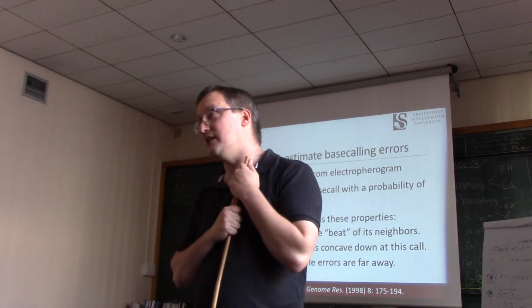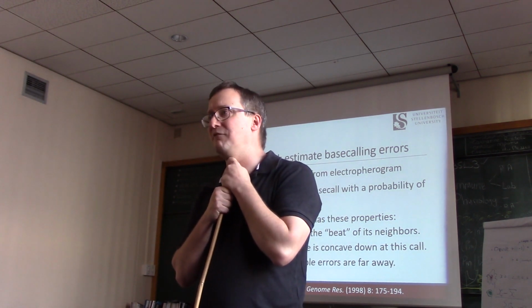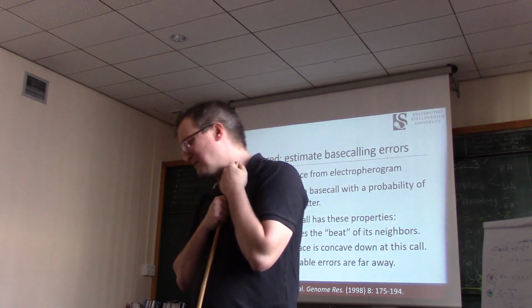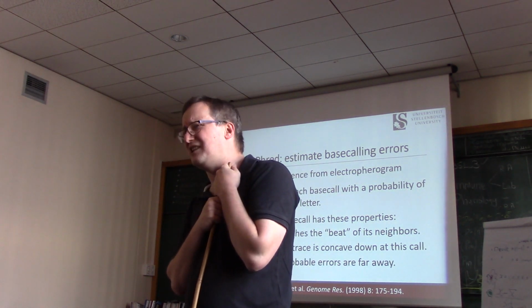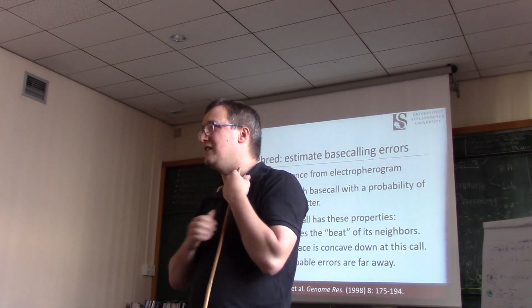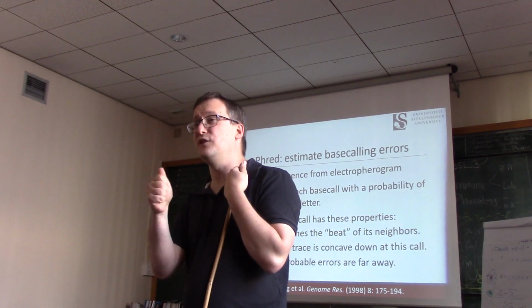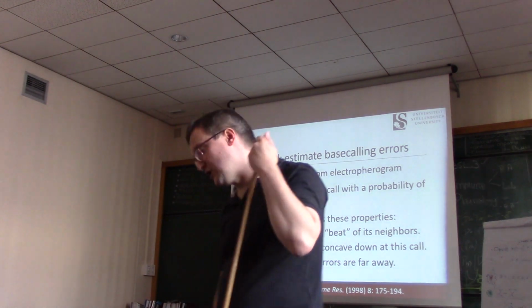And that is what Phred is for. Phred was created by a team under a guy named Phil Green, who was actually on my PhD committee at the University of Washington. It's a pretty amazing piece of software, and I don't feel that I can tell you everything about it, in part because of time, so we're going to move through it pretty quickly. But Phred has persisted over time as one of the dominant ways that we evaluate the quality of individual letters, individual base calls in a read. Very important to know that part.